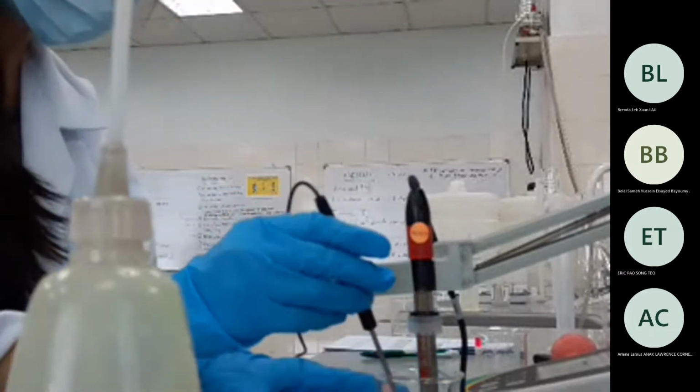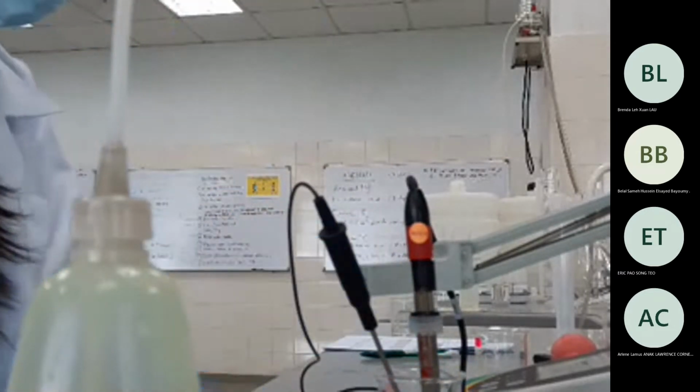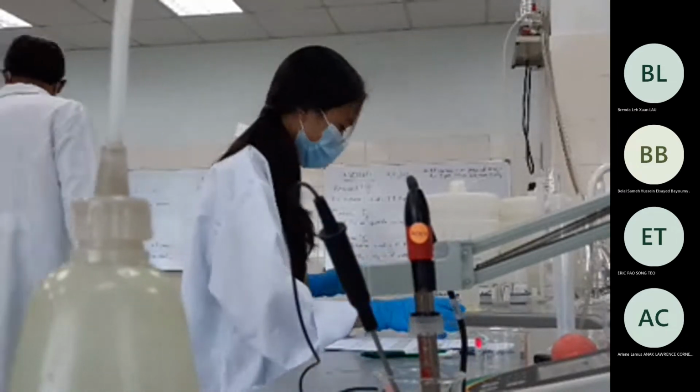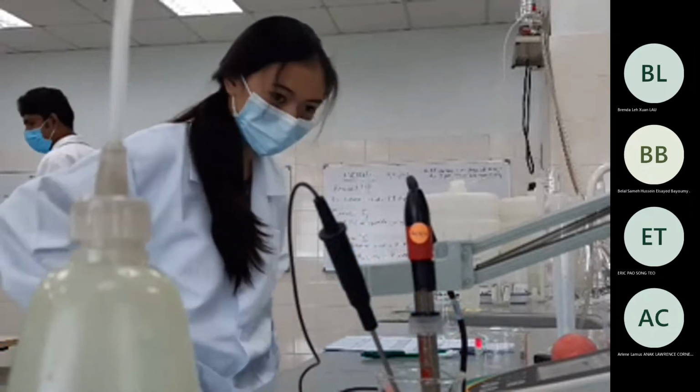And of course, we have to rinse, clean, clear everything, and sanitize before you move on.